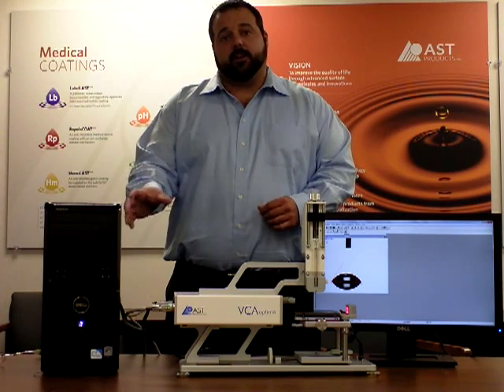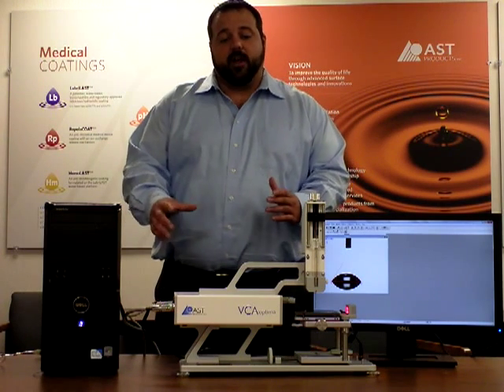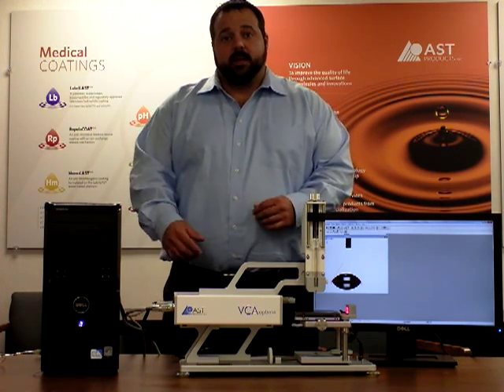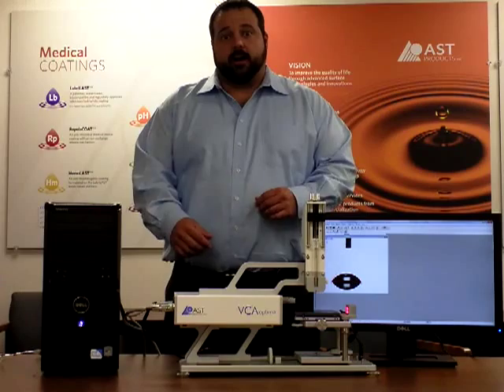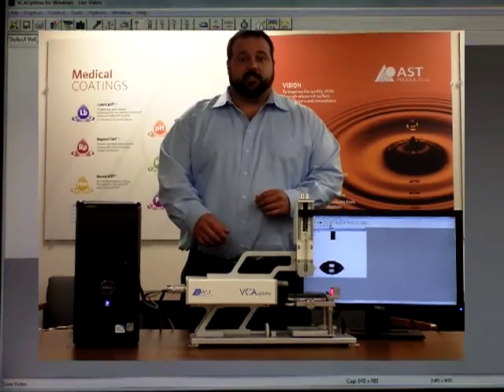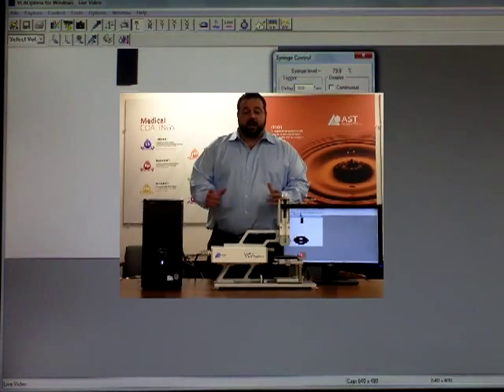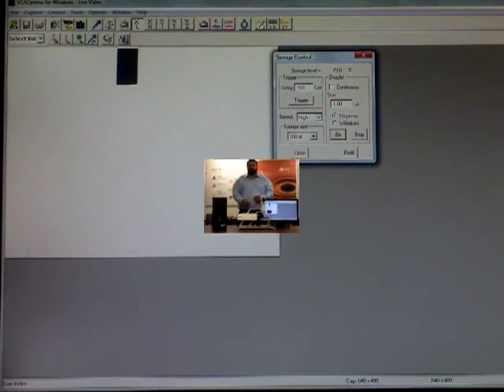The computer itself is pre-loaded with our VCA software. Today we're going to show the basic features of this software and show you how to measure a contact angle.